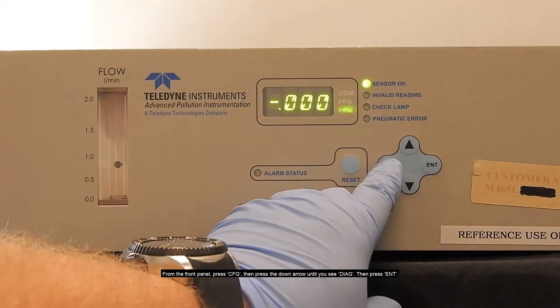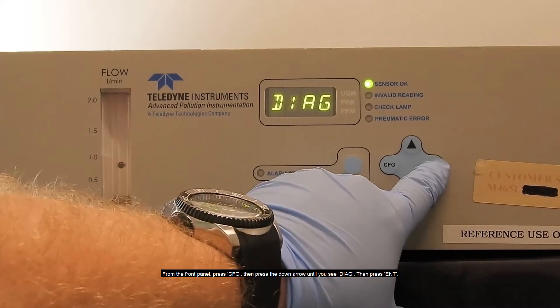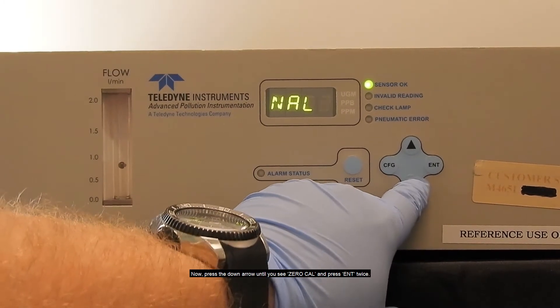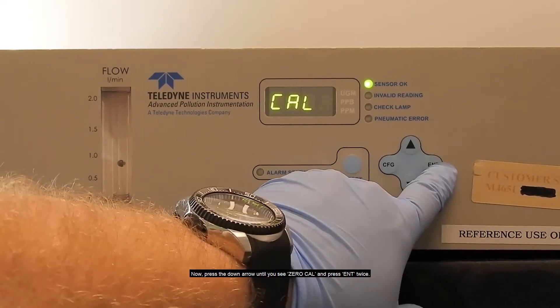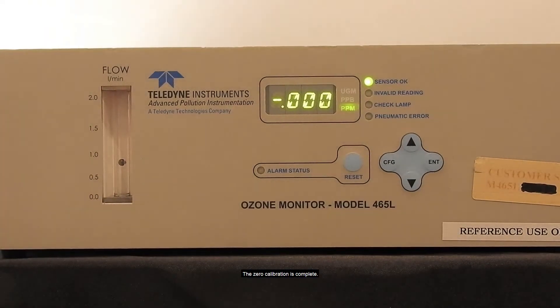press config, then press the down arrow until you see diag, then press enter. Now press the down arrow until you see zero cal and press enter twice. The zero calibration is complete.